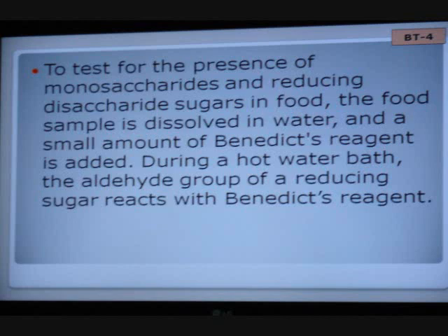Mine would be BT1, BT2, BT3, and BT4, and I know what they are. You won't know what they are, but I'll tell you later on as we start sharing results. So I won't know what yours are either, so I hope you take them pins back there, that magic marker, and mark at the very top of your test tube your initials, and on your list which one that was. You have your list, right? You'll need to have a list of your samples, and your initials identifies you, and then the number is the one that's in that test tube.